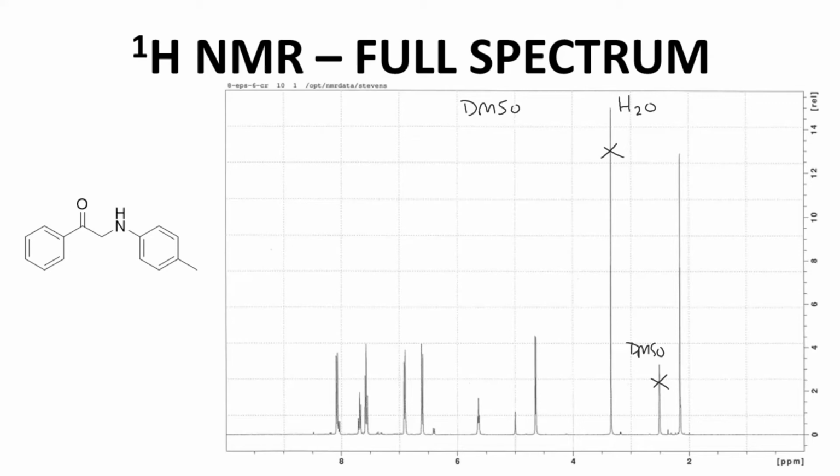And there are some small peaks that look like they're trying to hide, but they can't hide in the NMR spectrum. So this peak looks like an impurity. It's definitely there, but it seems disproportionately small compared to the other peaks. There's something going on the side of this peak that looks like it shouldn't be there. Now, as it turns out, this peak as well stands out a little bit more, but it is disproportionately small. This product has an impurity.